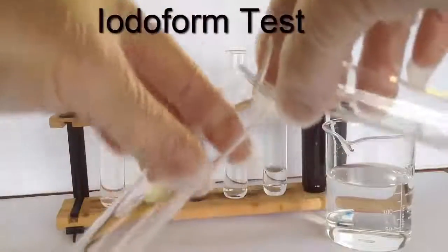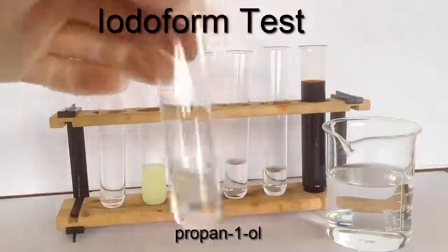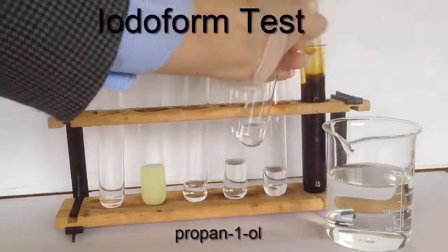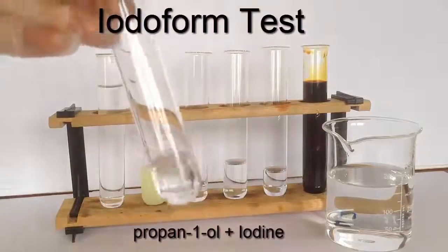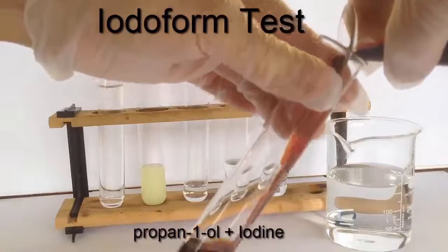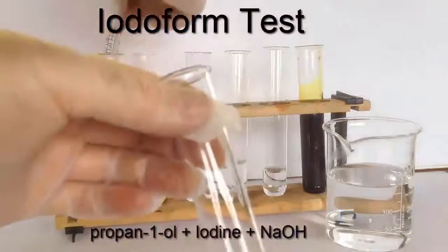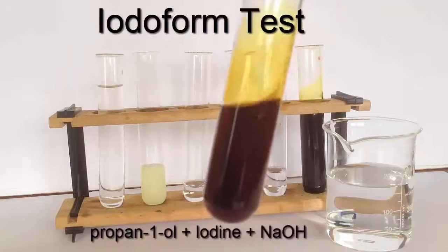So again, I'll take some propan-1-ol in a separate boiling tube, much greater volume than one would use normally for these tests, just so that it shows up better on the camera. I'm going to add about 1.5 times as much of 10% iodine solution, dissolved in potassium iodide. Note that iodine doesn't actually dissolve in water, but it dissolves in a dilute aqueous solution of potassium iodide. It actually goes into solution as the I3 minus ion, from which I2 can be liberated very quickly. Anyway, next I add the 2 molar aqueous sodium hydroxide.